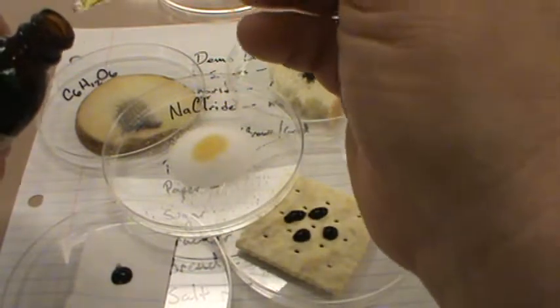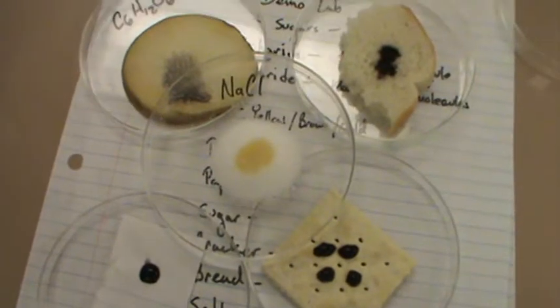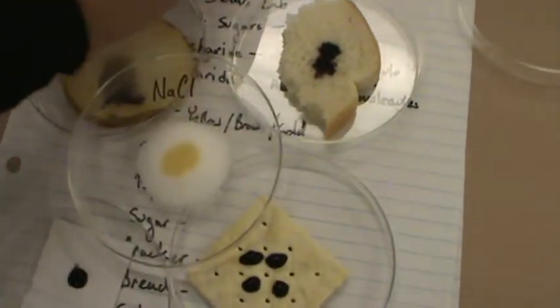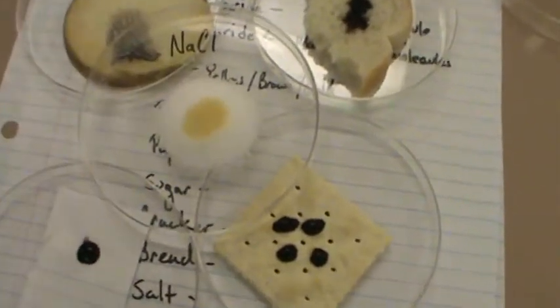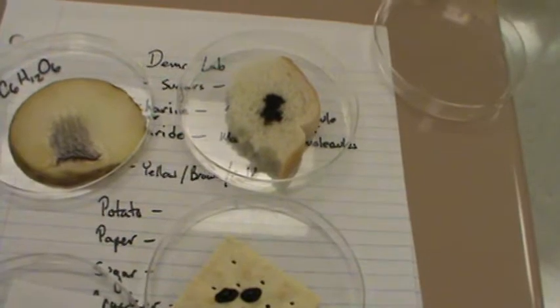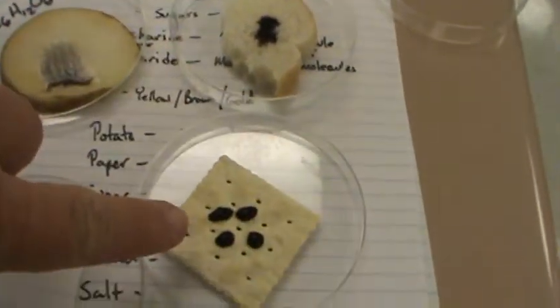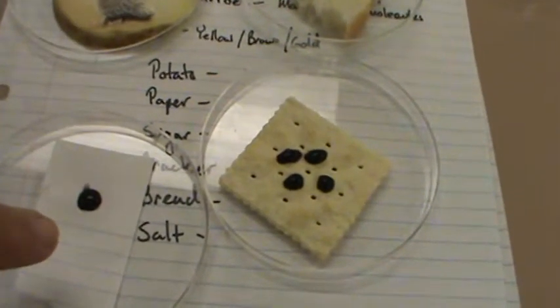As a matter of fact, most kids say, well, that looks like an egg, Mr. B. And so sure enough, it does. So as we look down on here, there's our results of our experiment. Of course, here's the sugar cube over here. The sugar cube and the salt did not change colors, whereas everything else, these four items, the potato, the bread, the cracker, and the paper did change colors.